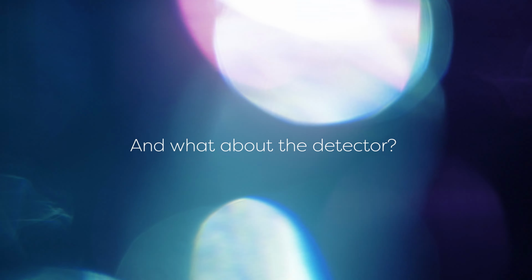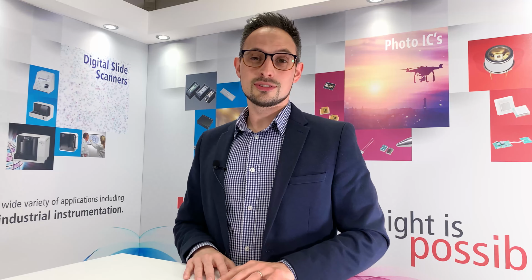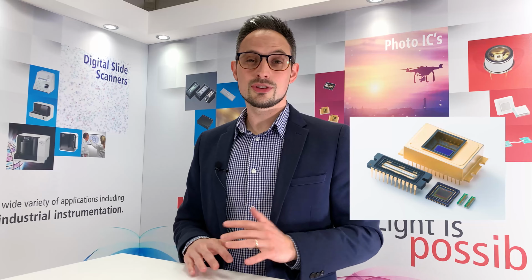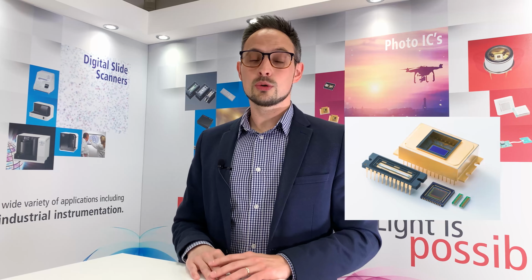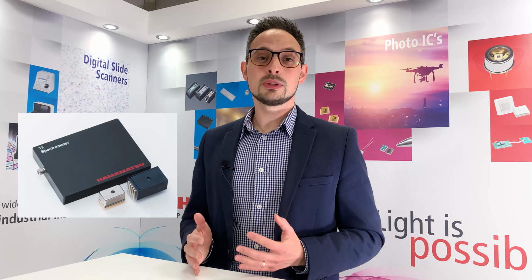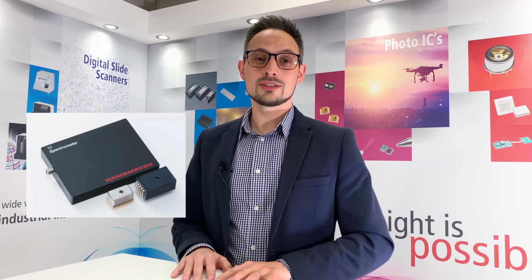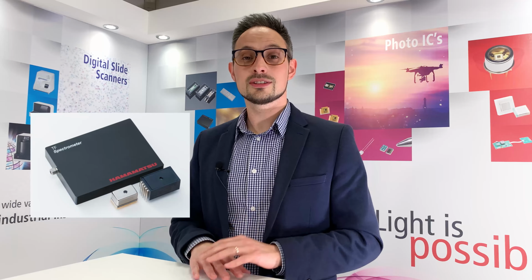And what about the detector? So for most spectroscopy applications, you have the standard option of a silicon detector, which offers high sensitivity from UV to NIR in the range typically from 190 to 1100 nanometers. These come in the form of photodiodes, a CCD or CMOS image sensor to capture the whole output spectrum, or then even a complete mini spectrometer, which also includes internal optics and signal processing, making your setup much easier.